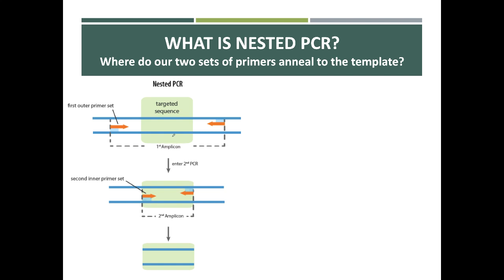However, it is possible, as I said, that they could bind to other parts of the DNA, of the chromosomal DNA. And so I'm just going to draw them here. This is our first PCR at a target sequence that is not our desired one, somewhere else in the genome. Now when we do the second round of PCR, as I said before, it's going to specifically target these regions inside of the initial two sequences.